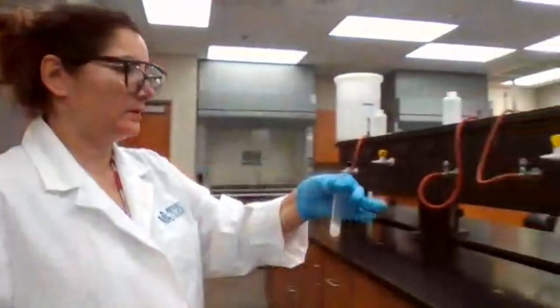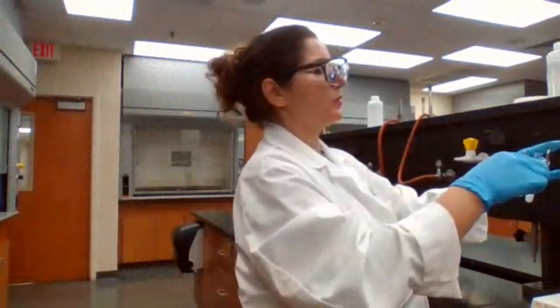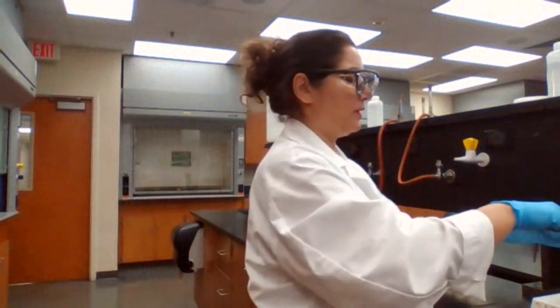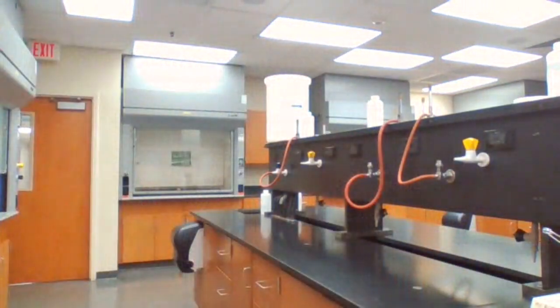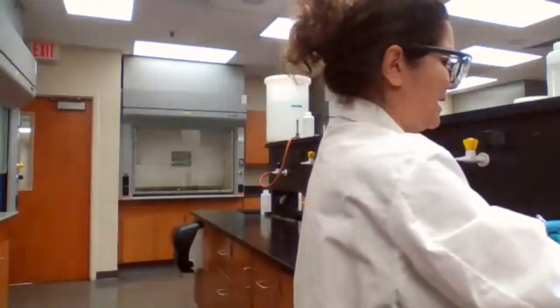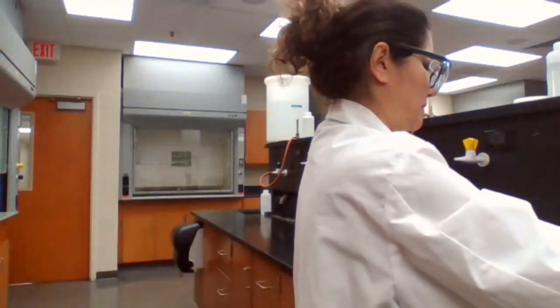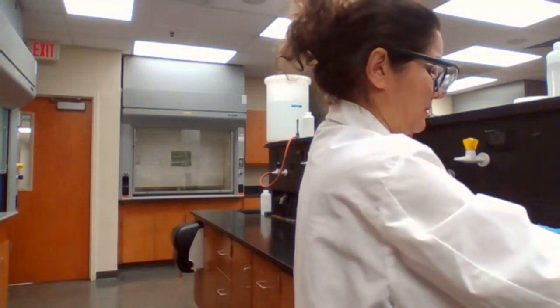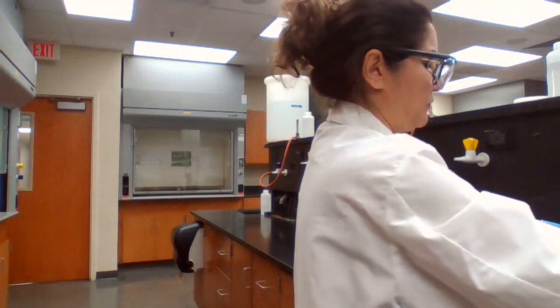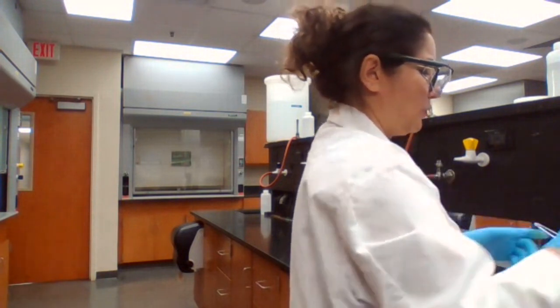I added hot water, the procedure, or you could add cold water and then heat it up, but I added hot water and I'm going to keep it in the hot water bath to make sure that the lead chloride dissolves. Keep it for 1 minute in the hot water bath. We're going to keep it for 1 minute. So I time it for 1 minute and keep it in the hot water bath.